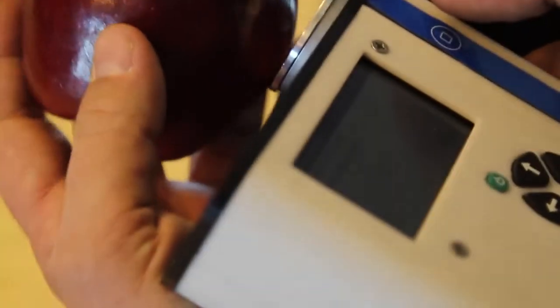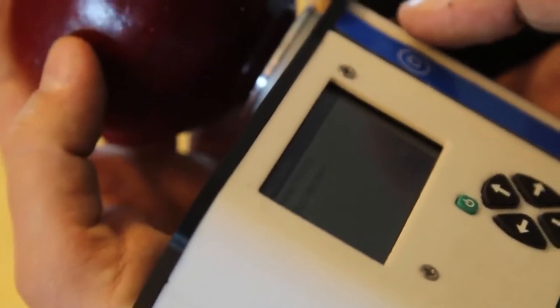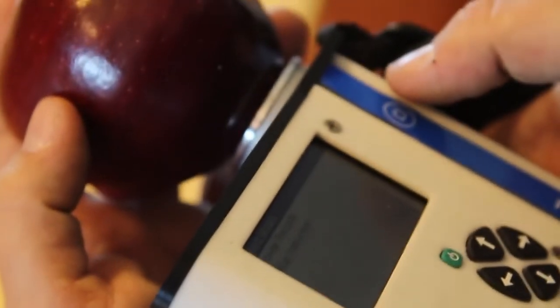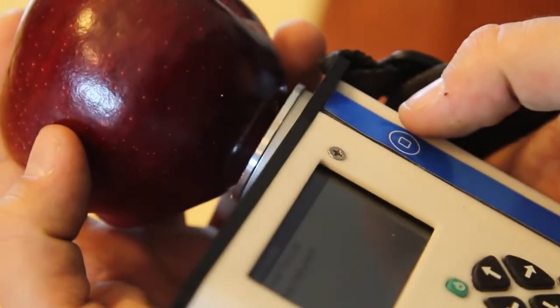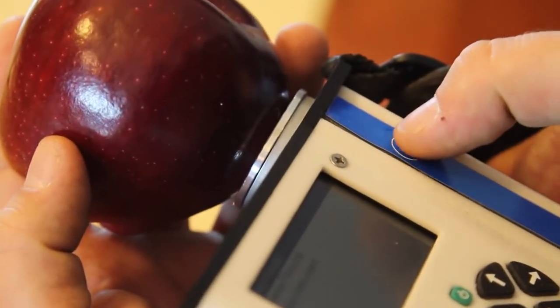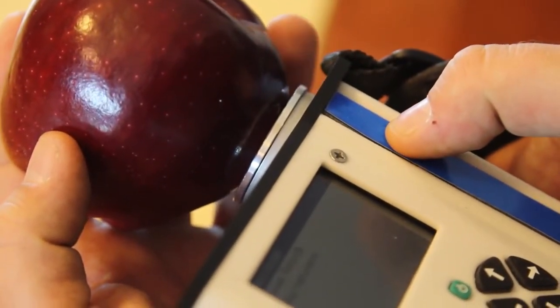To take a measurement, simply hold the apple onto the front of the F750 and press the blue thumb button.